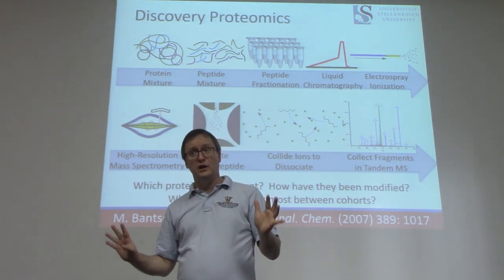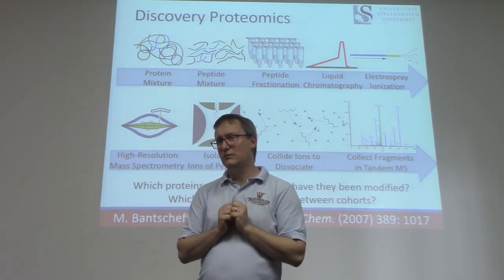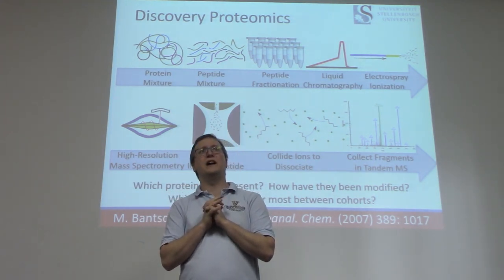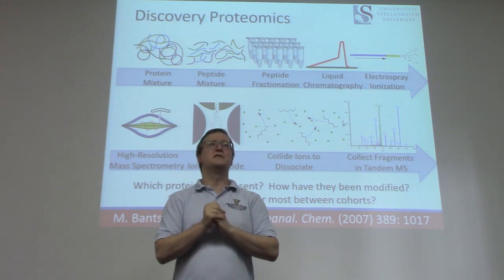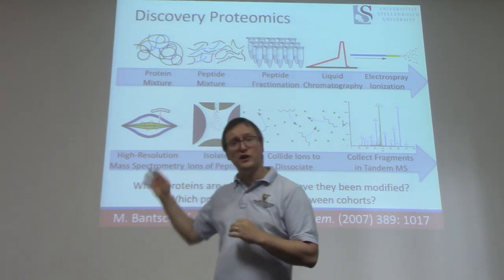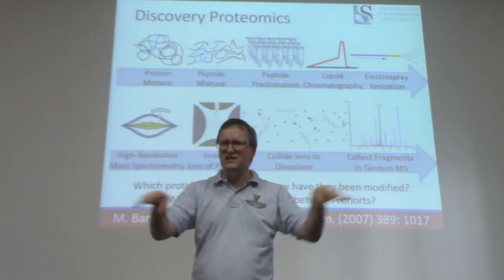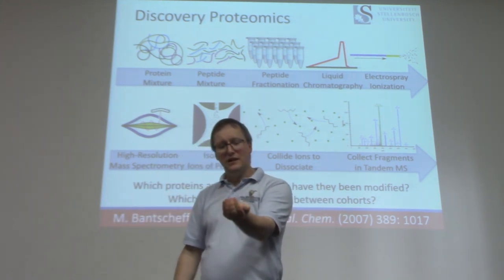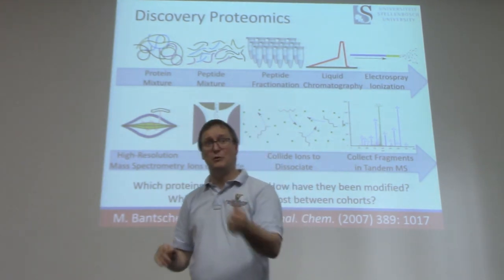Frequently, at least in the rest of the world, if you have a very complex mixture like a total cell lysate, you're going to rely on some kind of fractionation. There are lots of methods for this, but they range from things like separation by isoelectric point. Some people will separate their proteins in gels before they do digestion. Some people will do separation by a method called strong cation exchange. There's a long list of these, but these fractionation methods are designed to take this superset of all the peptides from a mixture and carve them up into, say, tenths or twelfths, or in extreme cases, 96ths. Maybe you have a 96 well plate that now reflects different 96ths of the total peptides of that mixture. You really can spend that much instrument time on one sample.